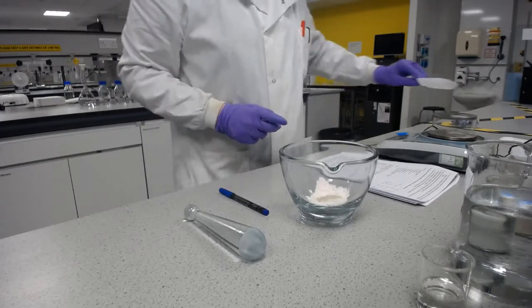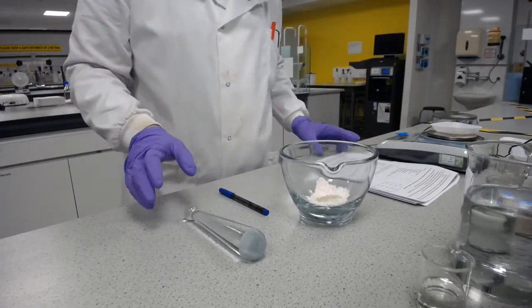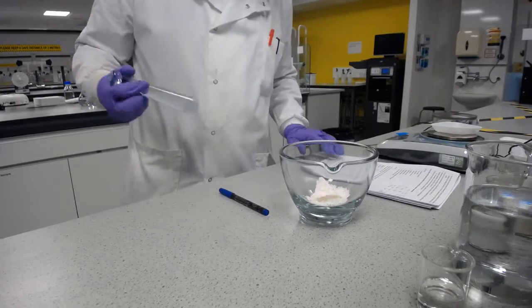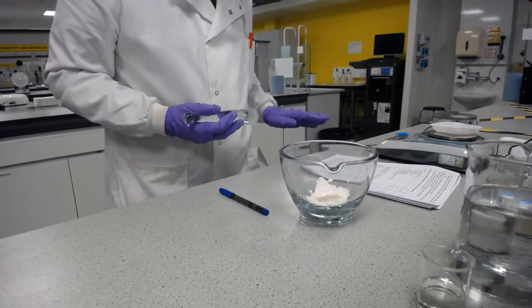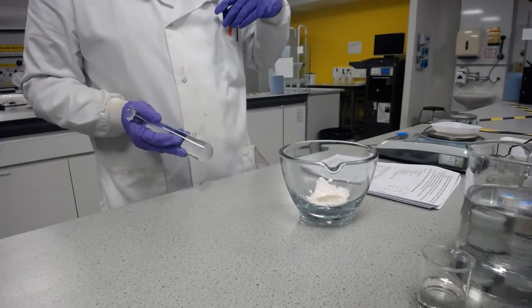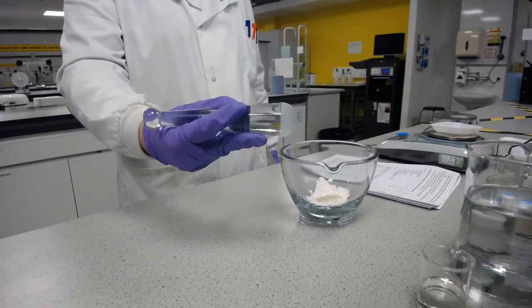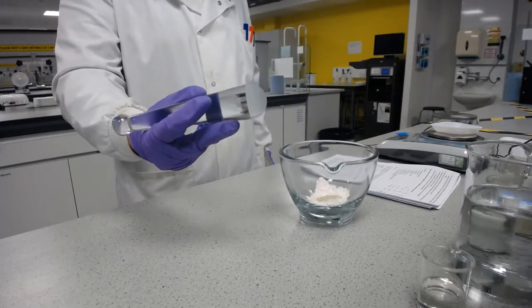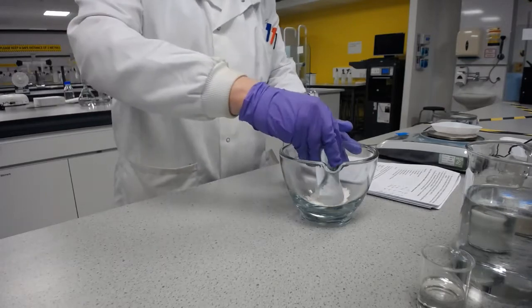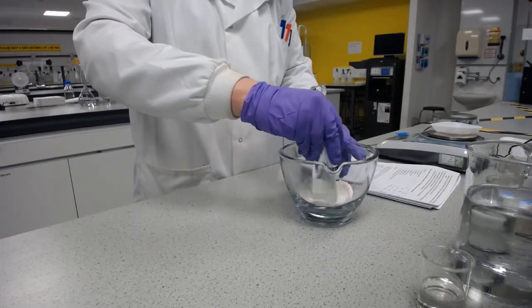Okay, so now, leave that there. Now we need to mix our dry ingredients. And if we see, it says here in the script, with a gentle motion, not applying a large amount of force, mix the ingredients in the pestle and mortar. For this gentle mixing, you can hold the pestle like a pen. There we are, like a pen, a very big pen, and then with just a gentle circular motion. I'm going to mix all these round.